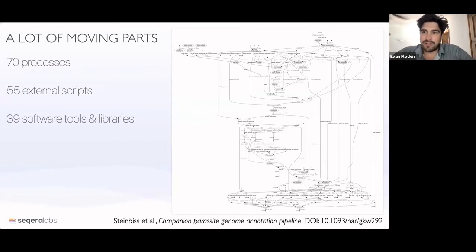And this was the bane of bioinformatics for a long time: the actual installation of the software. And I'm sure many of you have a lot of experience where, before you start the project, you typically spend a significant amount of time just setting things up. And containers, and one of the main things we do with Nextflow, really eliminate that. So it really has to be set up once, ideally by one person, and then once you're set up, you're good to go.